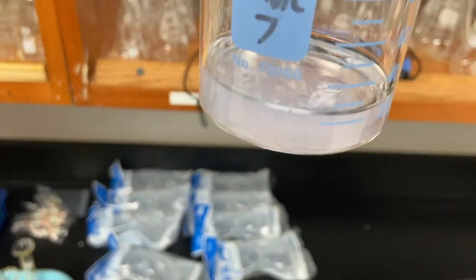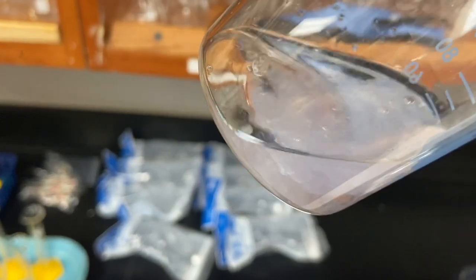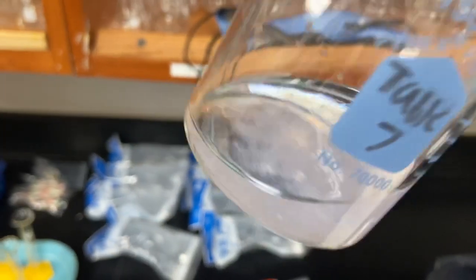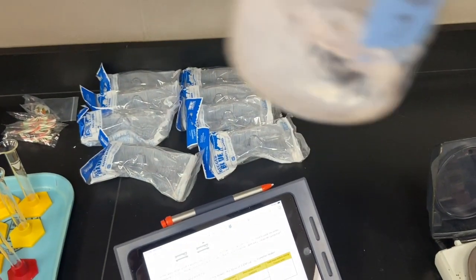So if we look really close, it kind of appears like we have a solid that's formed. It almost kind of looks like, if we swirl this up a little bit, like a snot of some degree, a goopy mass. Let's give this a good swirl.